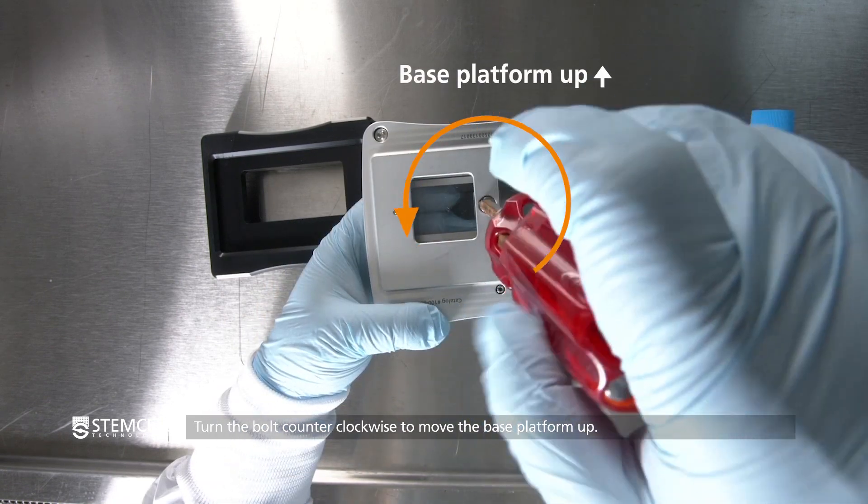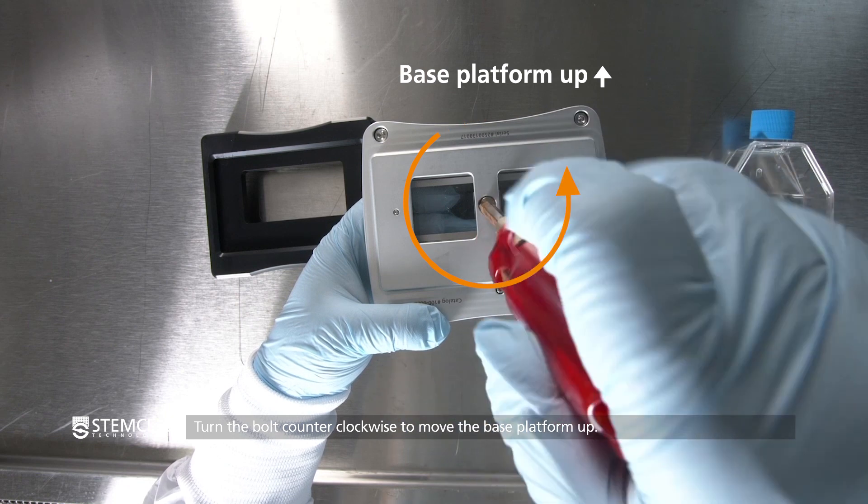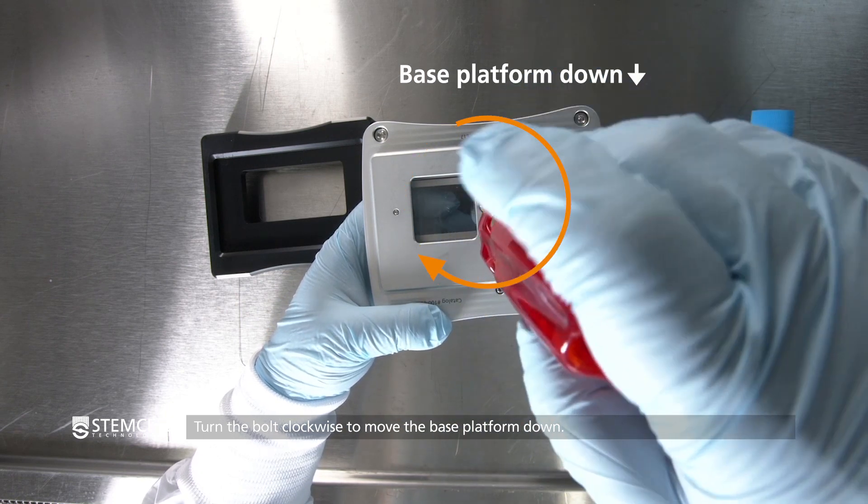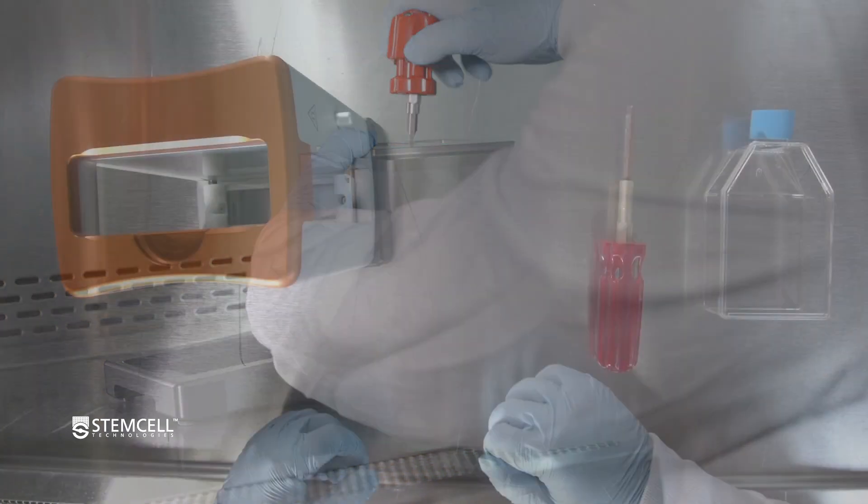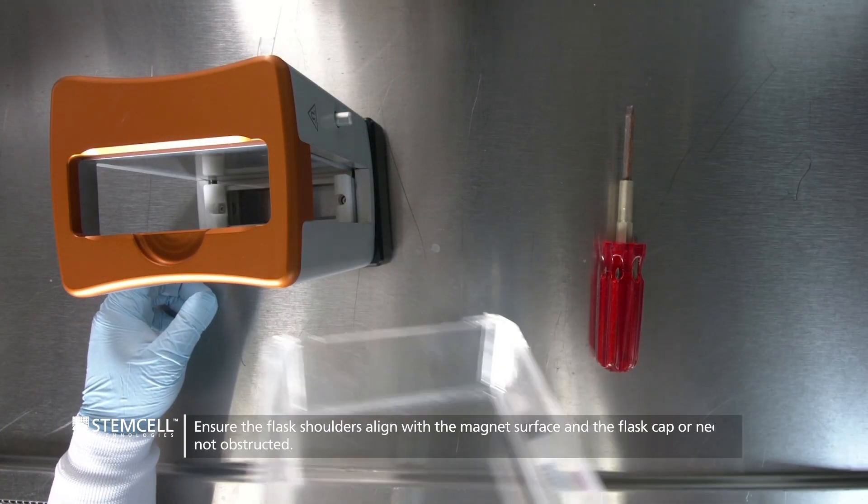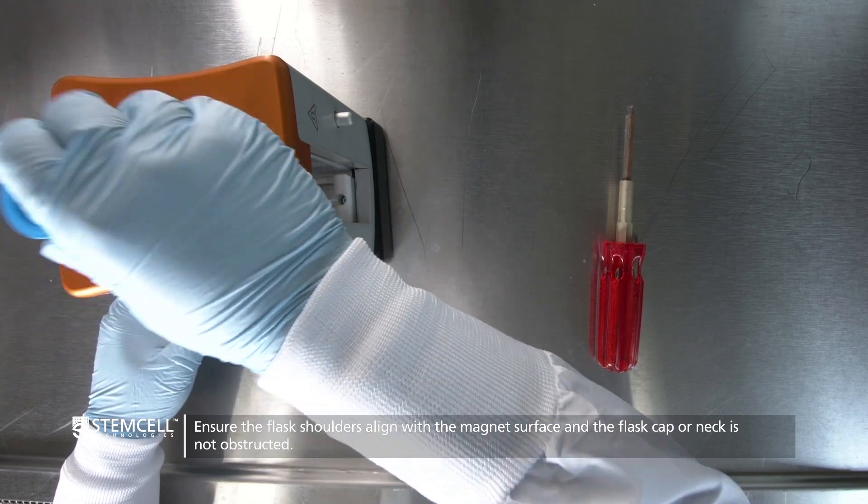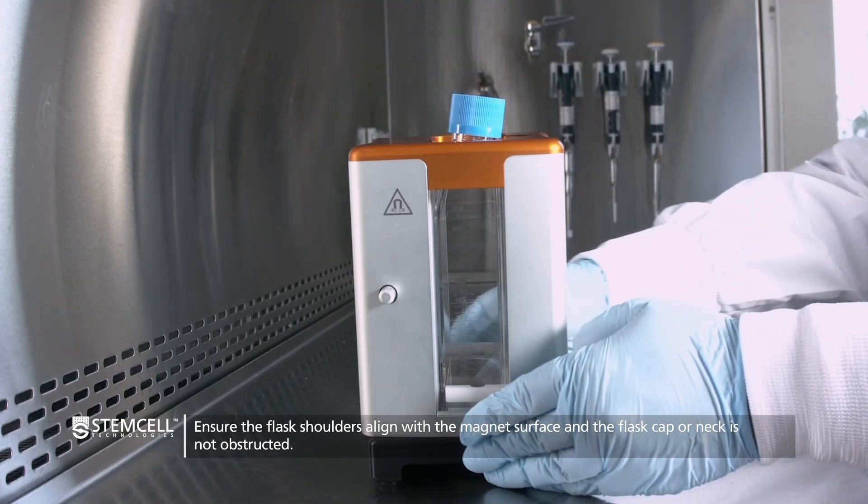Turning the bolt counterclockwise will move the base platform up. Turning the bolt clockwise will bring the base platform down. Adjust the base platform as needed until the flask shoulders align with the magnet surface and the flask cap or neck is not obstructed.